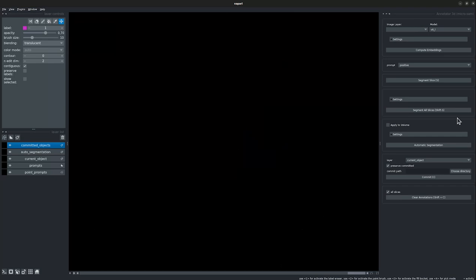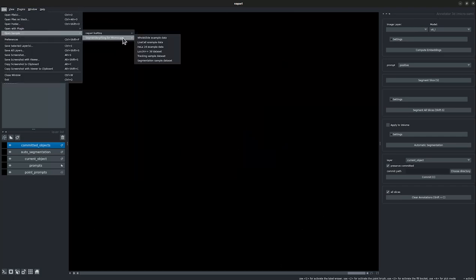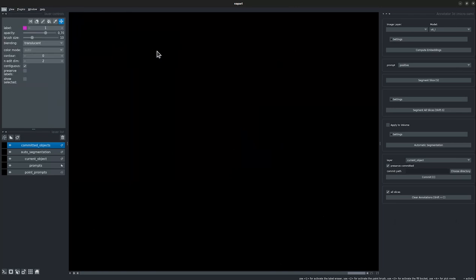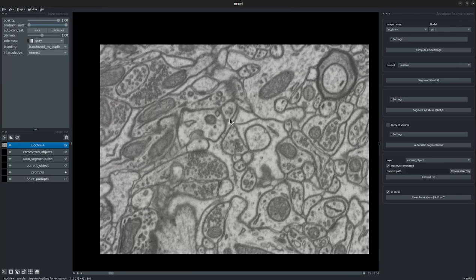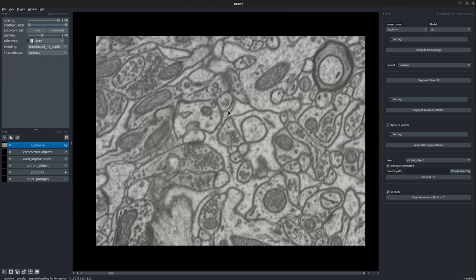On the right we have the annotator widget. Let's open a sample image. Let's drop the image layer at the end. Now let's go to the embedding widget. Before we get started, let's review the embedding widget, which we will use to load the pre-computed embeddings, as it takes a couple of minutes on CPU resources.